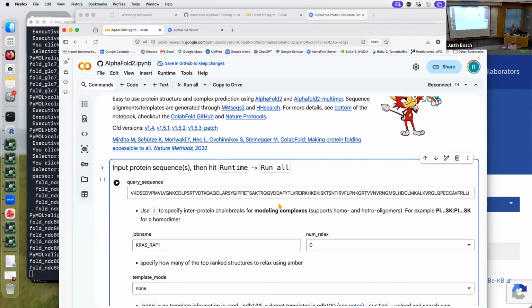One of the wonderful things was, because AlphaFold 2 was released the day the code was released, people could create servers that allowed more accessibility to all the different things that you could set that would make the calculation run differently. And so that's what Sergey and Martin Steinegger did, and Milo Mirdita. They produced this wonderful service; it's amazing how effective and important this was in bringing AlphaFold 2. If everybody had to download it and put it on a GPU machine, very limited numbers of people know how to do that. But there's a web page and you can just put the sequence in and get the results on somebody else's GPU. It's great. You have to have a Gmail account to make it run because it's Google.